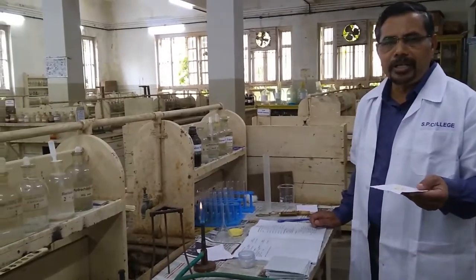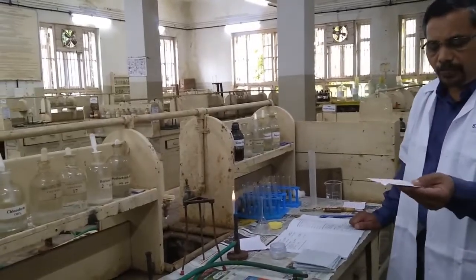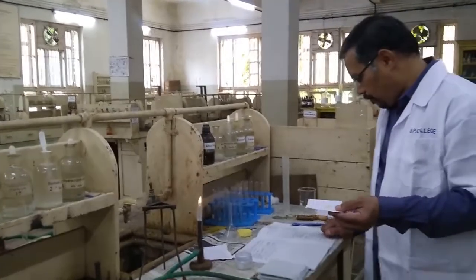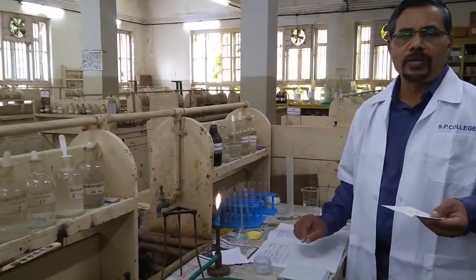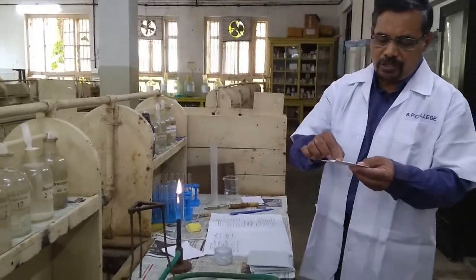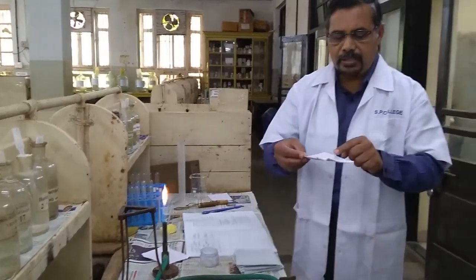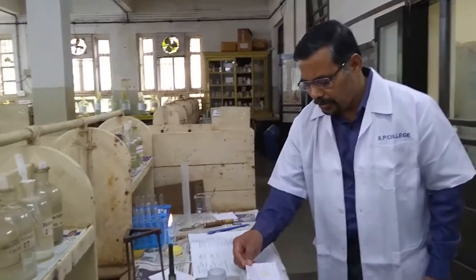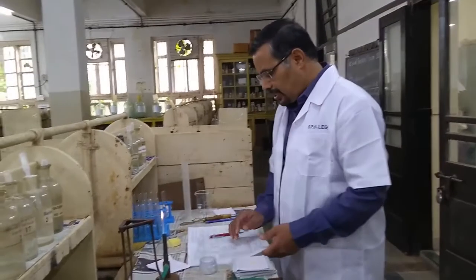The second preliminary test that we will observe here is the nature of this given mixture. We had already studied that the nature of given mixture is either crystalline or amorphous or hygroscopic. So here the given mixture is crystalline. We can easily observe the crystals of this salt given in the mixture, and therefore nature of given mixture is crystalline.